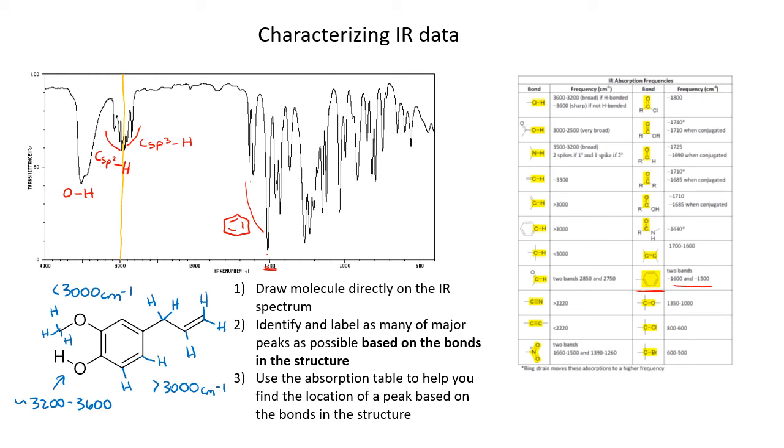And at this point, we are done. We have taken into account all of the bonds that can possibly fall in the diagnostic region, and we have now fully characterized our IR data.